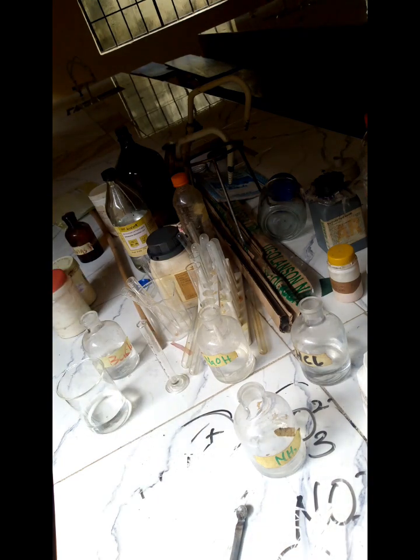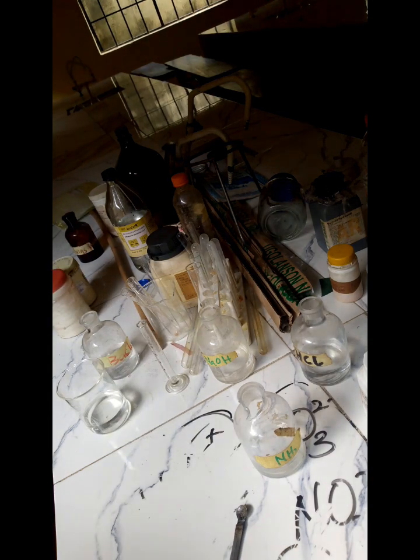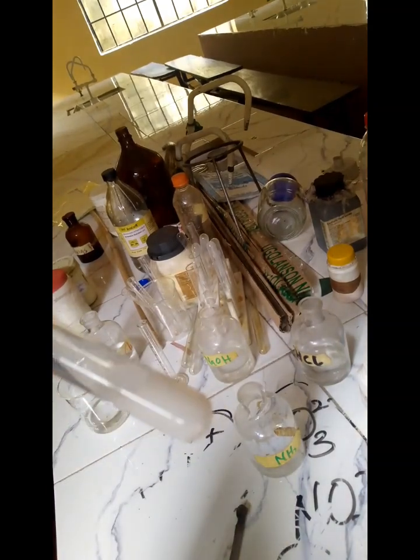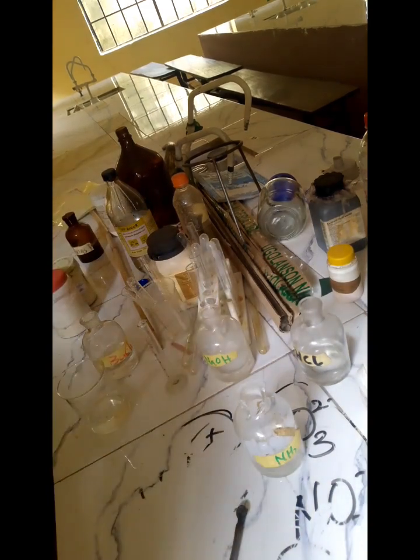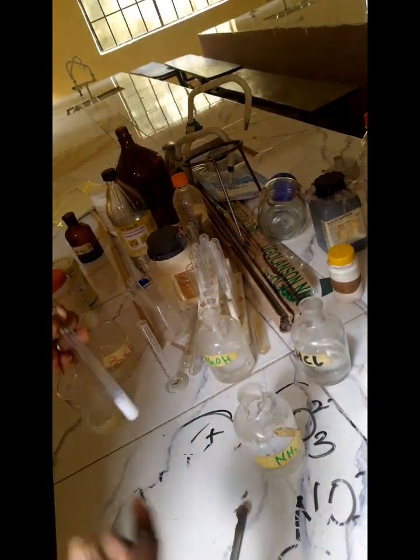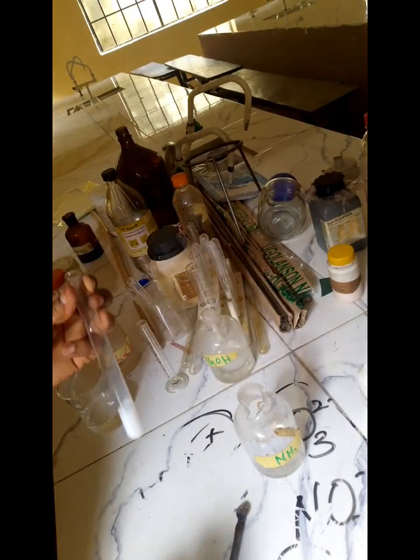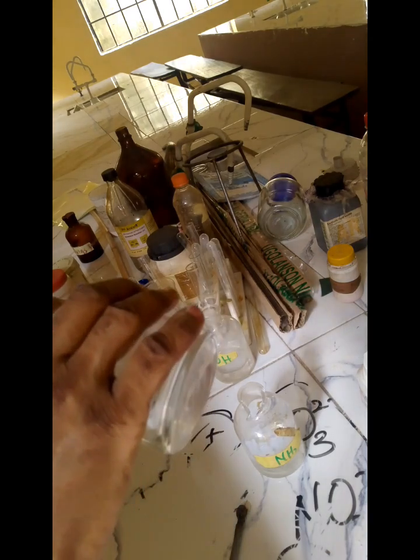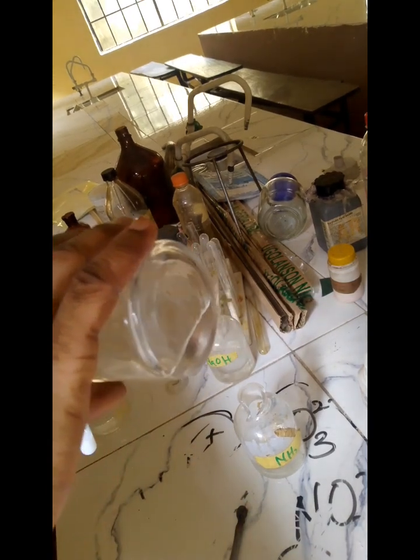So we have a white precipitate here with barium chloride. I hope you can still see it. Yeah, that's a white precipitate. So let's add dilute HCl to it and see what will happen. The precipitate is supposed to actually dissolve. Let's add it.